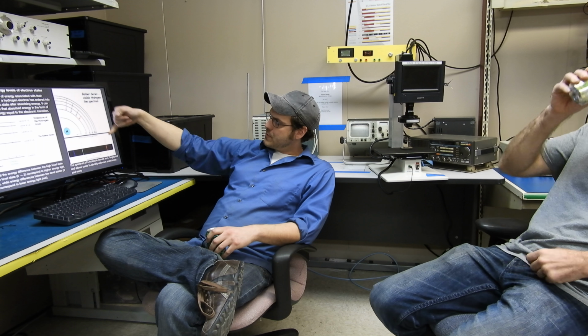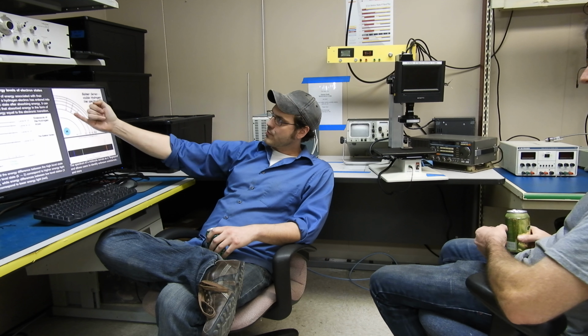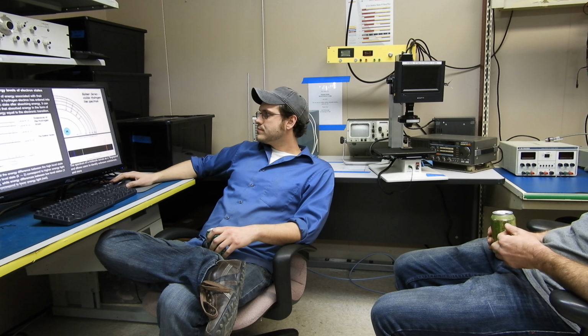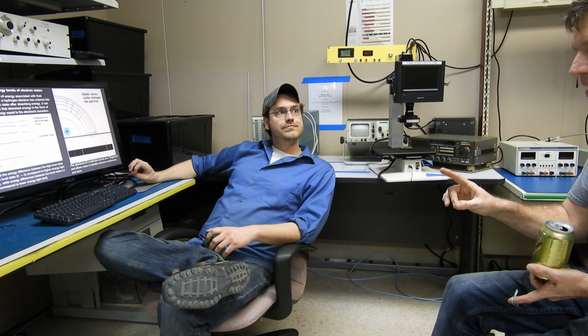So that transition corresponds to that line, that transition to that line. Those are wavelengths in nanometers. Now, hold on. E equals h nu. h is Planck's constant, right? So nu. Okay, I get it. Frequency, yeah, I'd have to be looking at those equations.